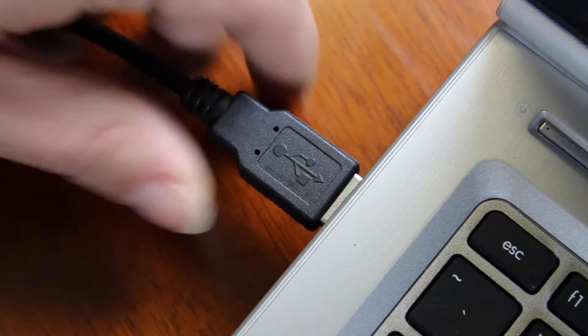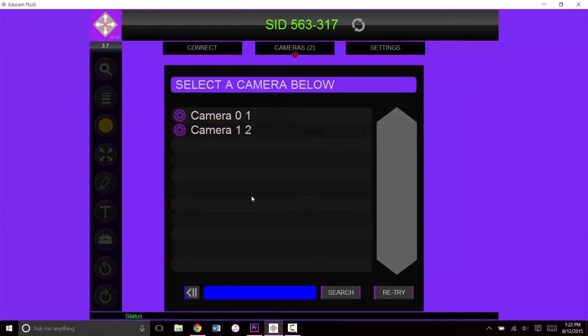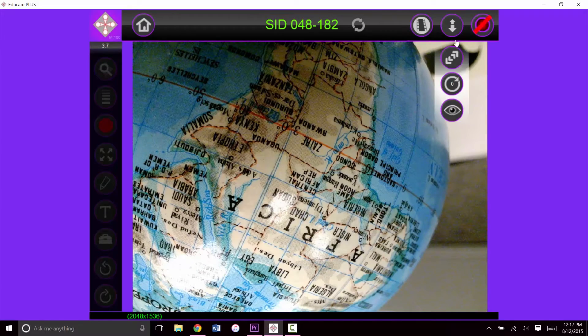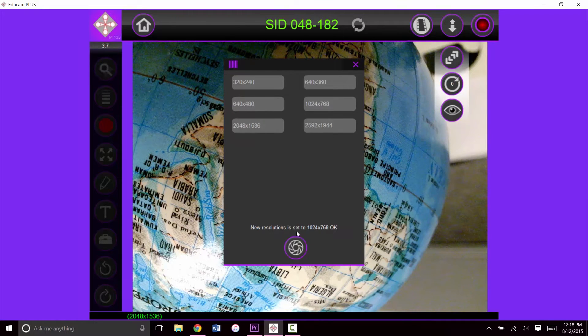Plug in your camera, open EDUCAM, and hit local camera to see the live image.